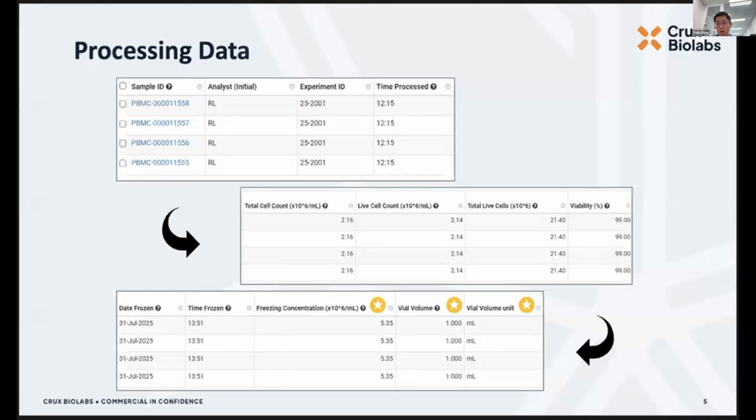And the reason we pull all the data into one single table is to give us a clear overview of the sample details without having to switch back and forth between the parent and daughter records. This also makes it much easier for our QA team and project managers to quickly find and retrieve the information they need to do cross-checking or the data transfer for our clients.